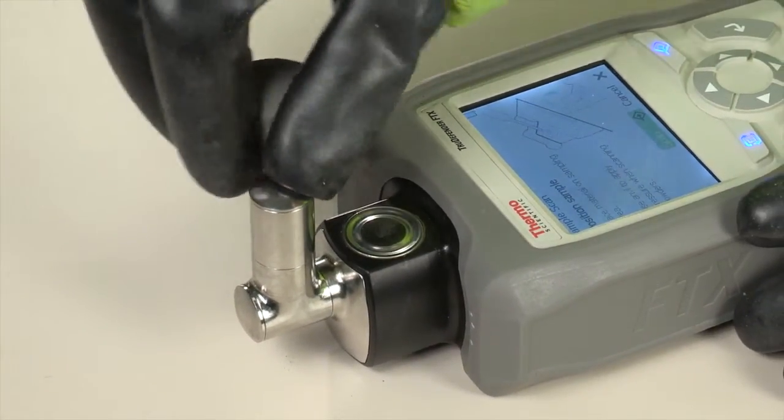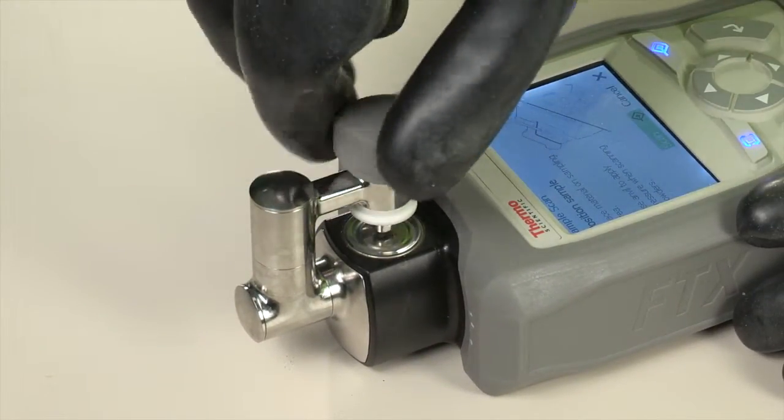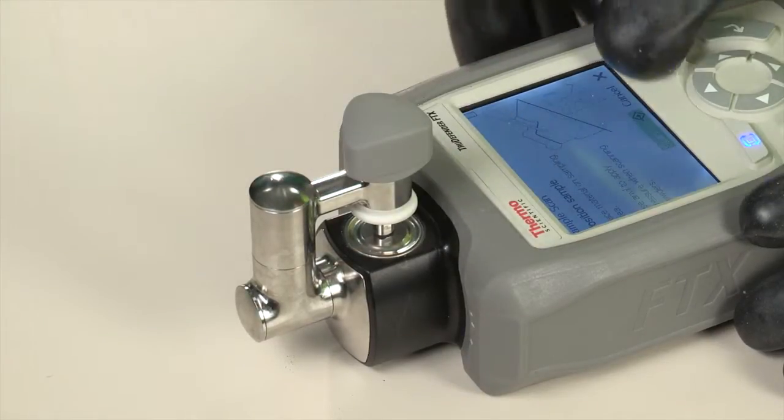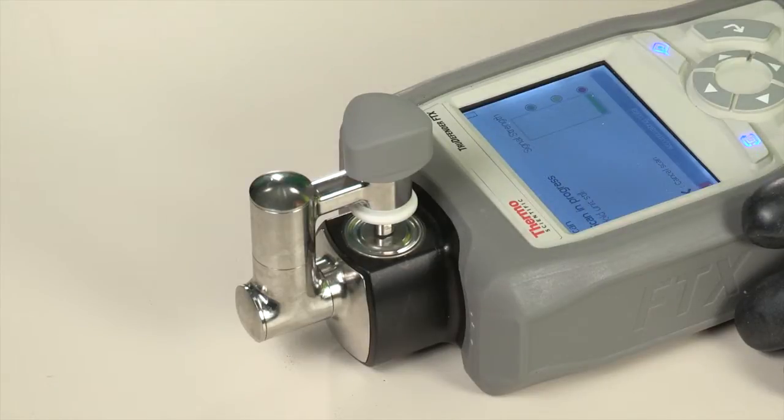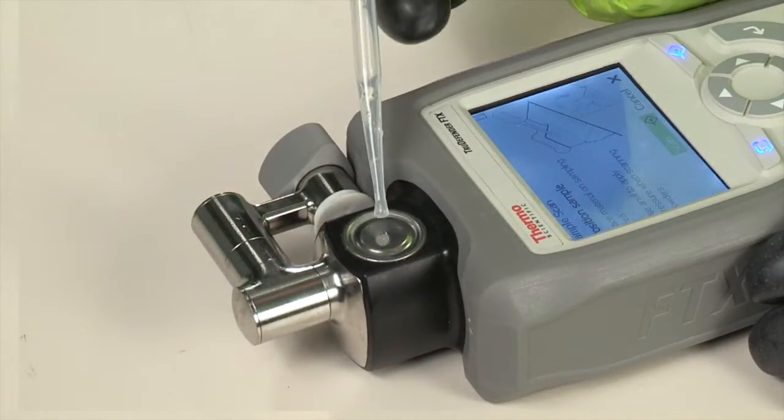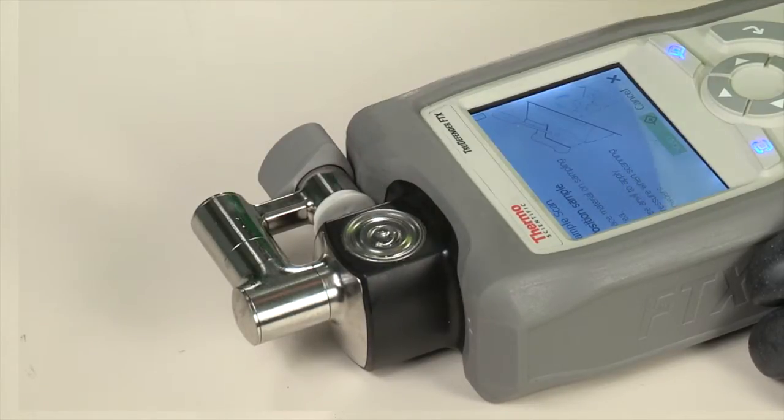The self-contained anvil mechanism ensures there are no exposed threads or friction points which could trap debris or explosive residue and serve as a potential detonation risk. These features also prevent chemical entrapment which could contaminate operators or subsequent samples.